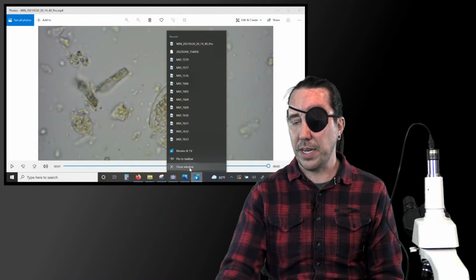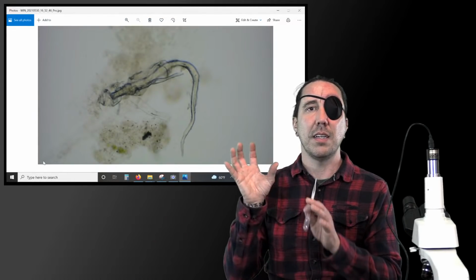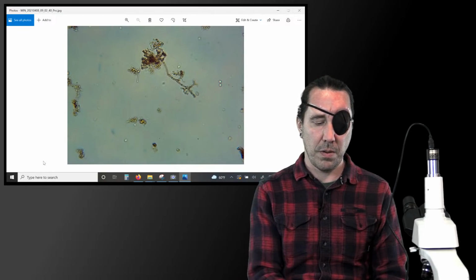You can multiply that times 4. Instead of counting all the bacteria in your field of view, just count a quarter of that and then do the multiplication. That's what I was saying. But yeah, to count bacteria, it's much easier to go up in dilutions with your centrifuge tubes so that you're counting less bacteria and you don't have all this other stuff that's blocking your view.